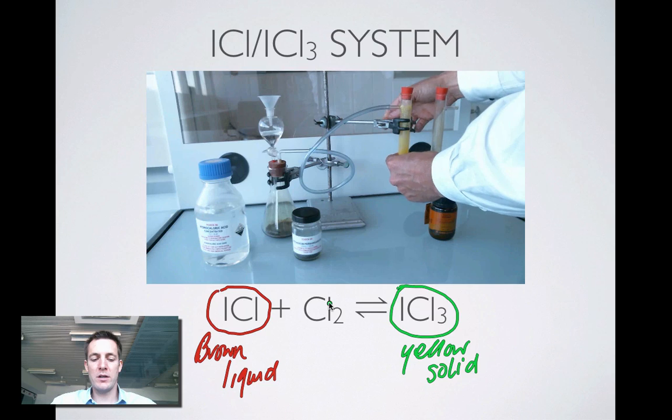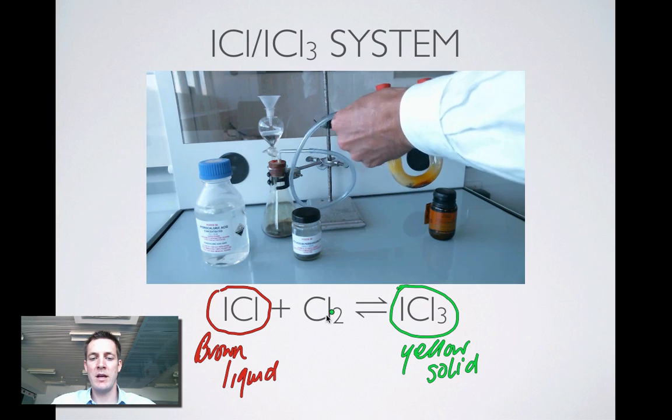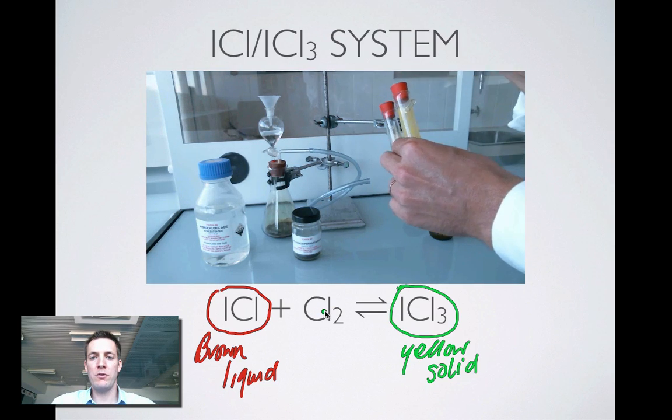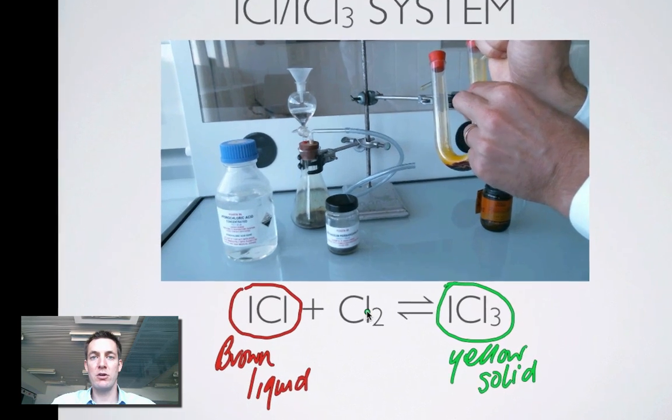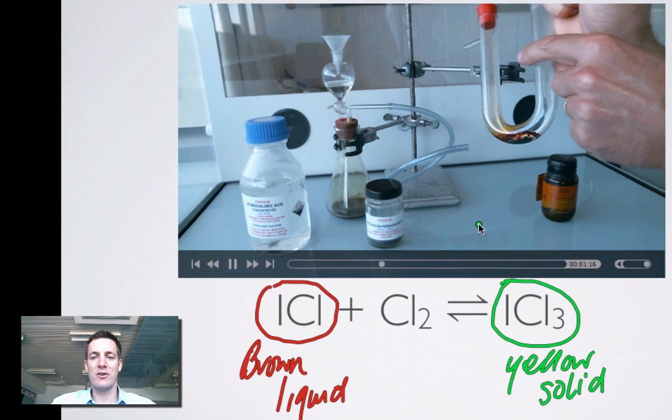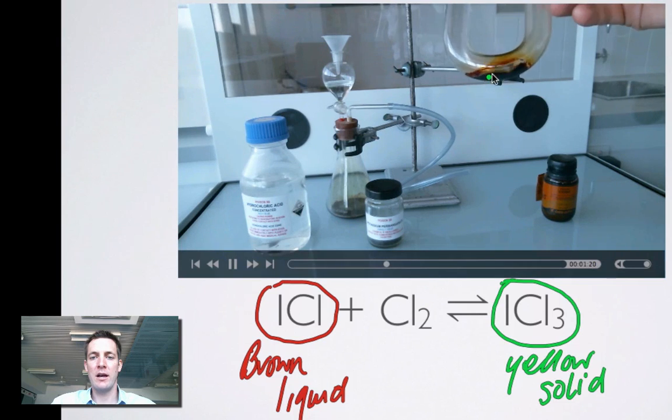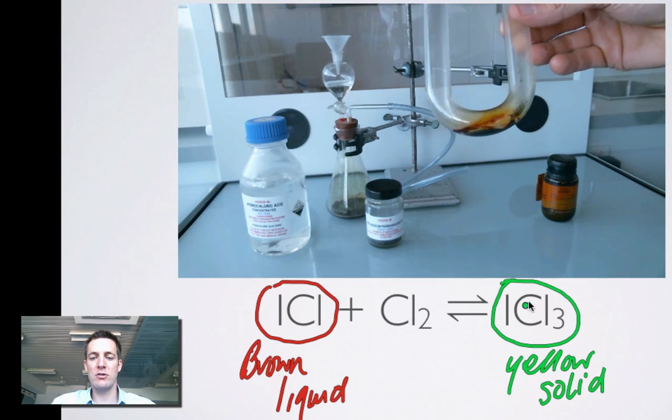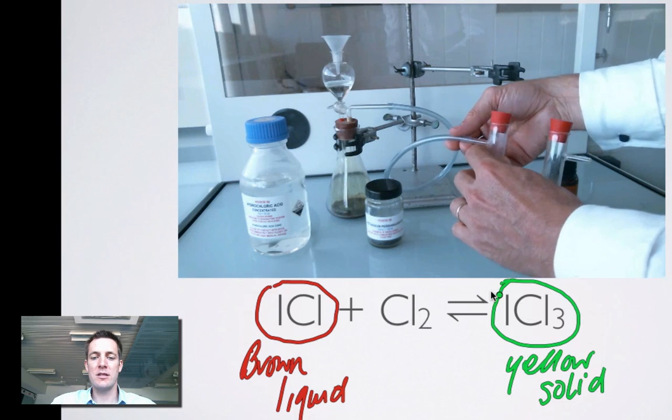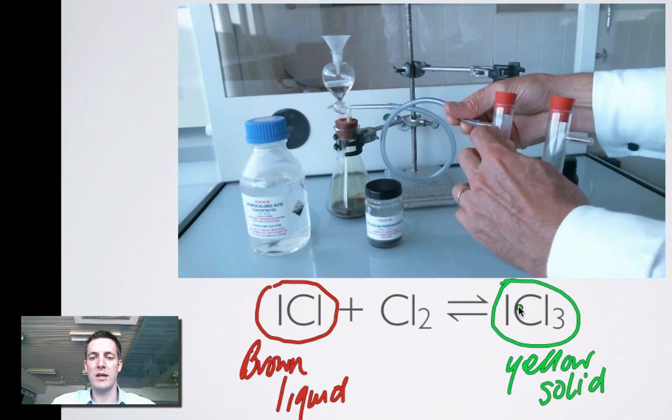So what we're going to do here in this experiment is we're going to observe what happens to this equilibrium system as we add and remove chlorine. The way we're going to remove chlorine here is by blowing through the U-tube. Doing this in a fume cupboard and trying not to breathe this stuff in. But we're blowing through the U-tube and we've removed the chlorine. And look what's happened. All that yellow solid has gone. We've removed chlorine and the system came over this way. It went to the brown liquid and away from the yellow solid.